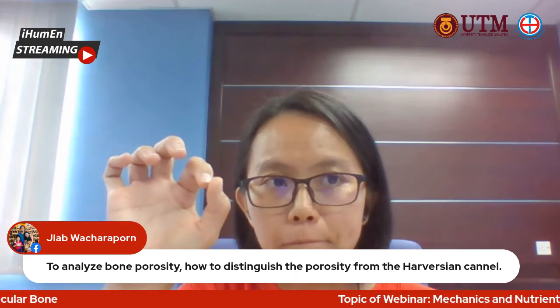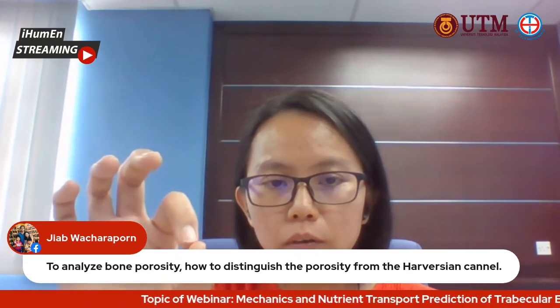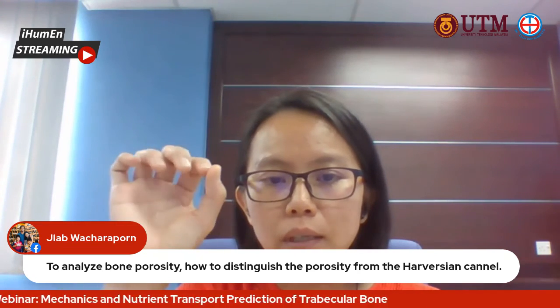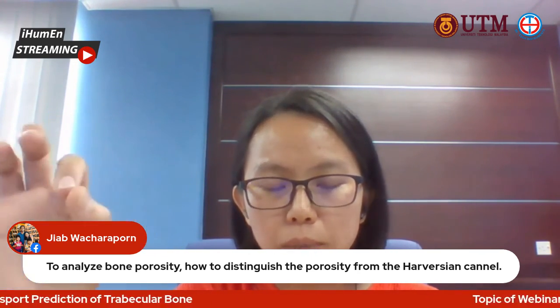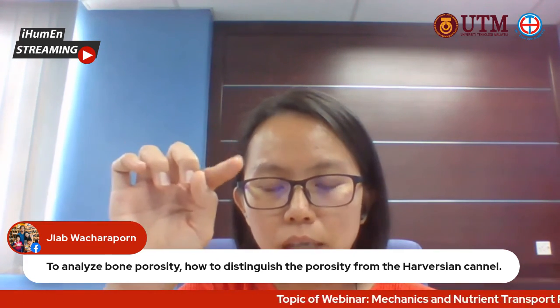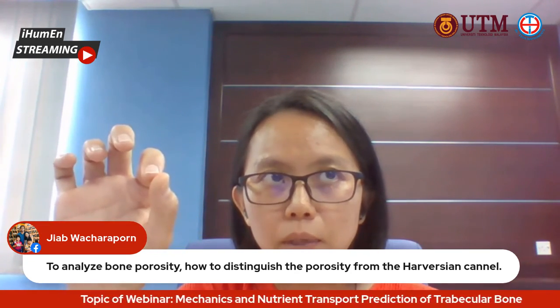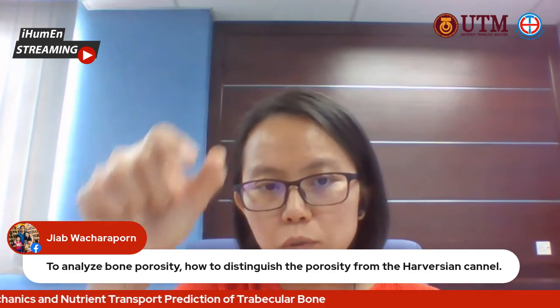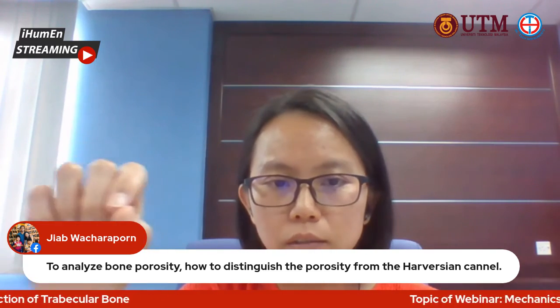The osteoblast cells have a diameter in the range of a few microns, about 5 microns. The Haversian canal is tube-shaped, and you can see all the networks built up and connected to each other.